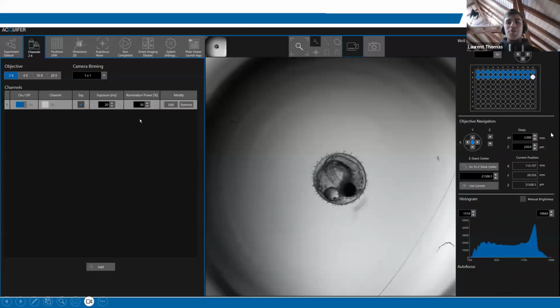For the sake of the example, this is the view of the software, basically the control software of the microscope. And for this experiment, the dummy sample I took is this Medaka embryo. It's a model fish organism that's used in biomedical research. I'm just illustrating with only bright field, but it's really just for the sake of the example. I could have put additional channels and so on.